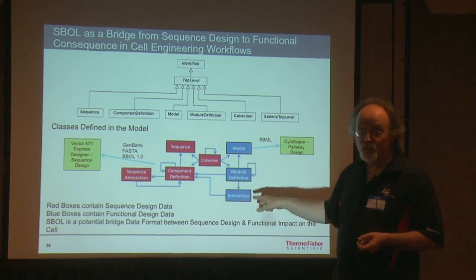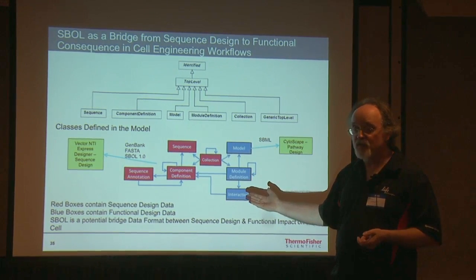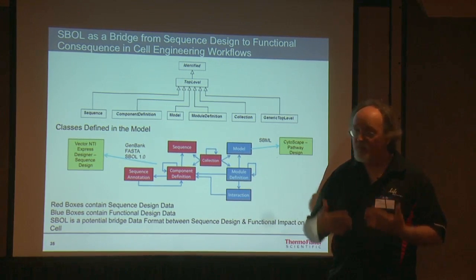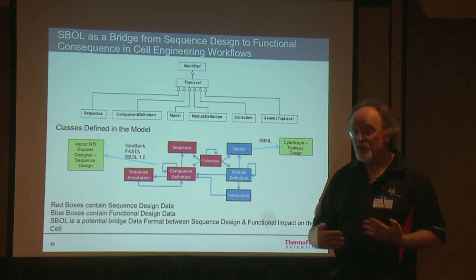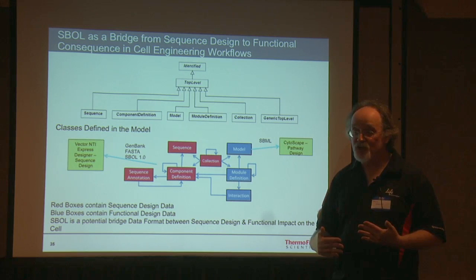Another thing potentially that would be very nice for SBOL or open source software in general is wouldn't it be nice if there was a way of actually tracking how the experiment is done? So again, we have a very simple way of doing experiments. We use all of our own reagents and we validate and verify to make sure that they all work together, and then we make recommendations on what you should use.